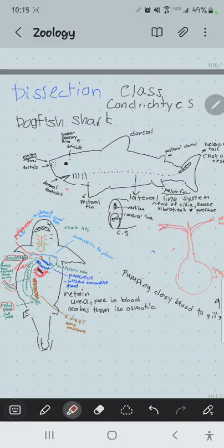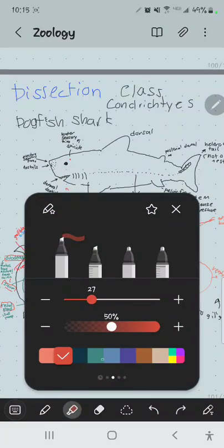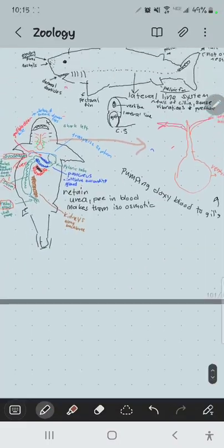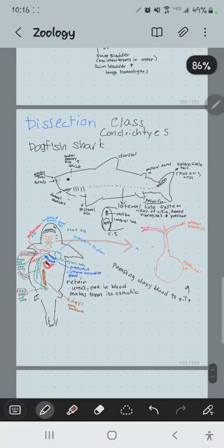If you're super motivated, if you're super enthusiastic about this, I think it'd be kind of cool to see the shark brain. I was mentioning today in class that a brain is a combination of all your ganglia stuck in one spot in your head, right? So let's take a look real quick. This is an optional dissection, I'll tell you what. And I know when I say optional, it means only people who are already getting A's want to do it.